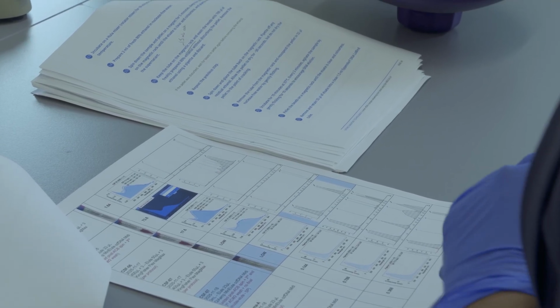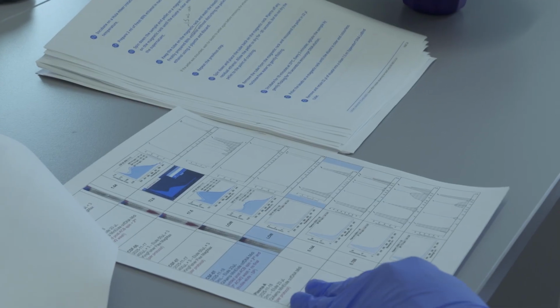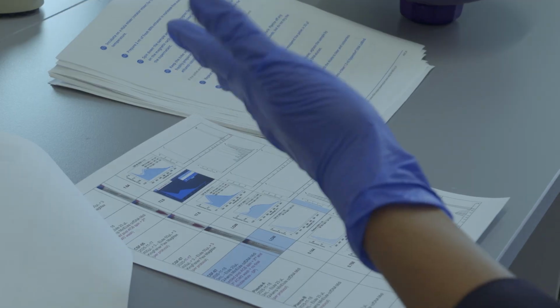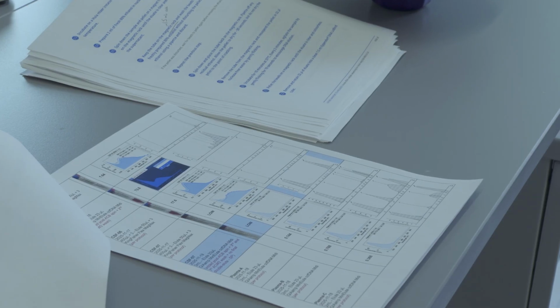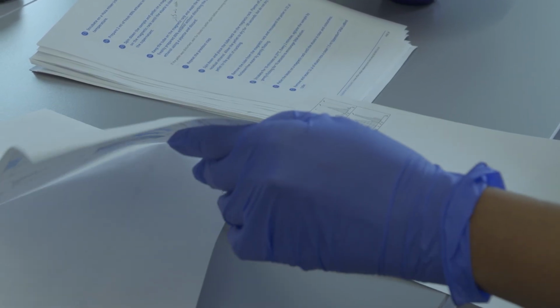Also with Bioanalyzer, that's what I experienced in the past, and I felt like Femto Pulse is the best, but that is also very expensive equipment, and we cannot expect to have it in every lab. So yeah, this is plasma, right? These are plasma again.